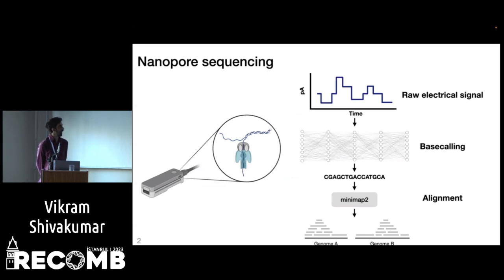And so one question is if we're interested in off-target or on-target regions, for instance, genome A is off-target in this case. We would sequence all the reads and then align them, and based off this alignment, we would throw out reads for downstream analysis. But this is pretty wasteful because we are still sequencing all the reads, and so we're still spending a lot of time sequencing reads that are irrelevant to our analysis.